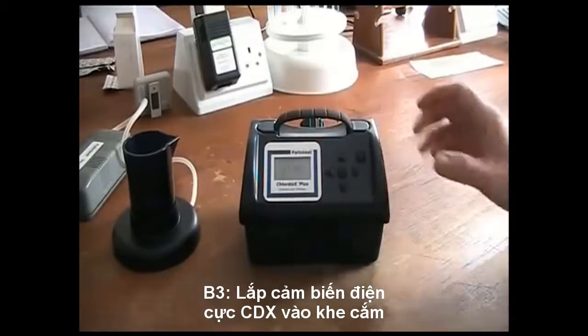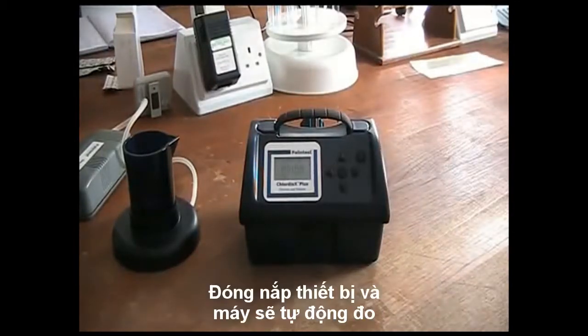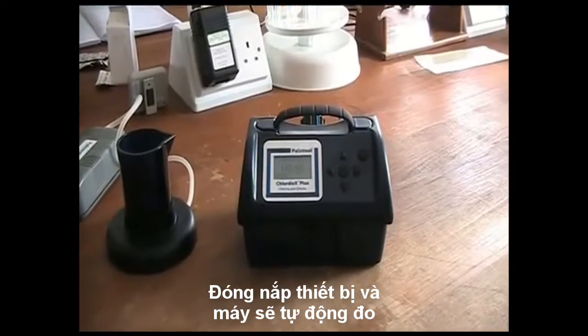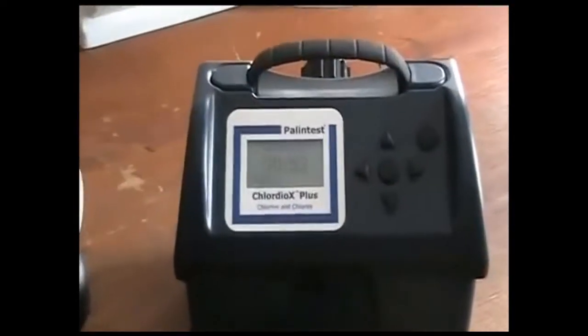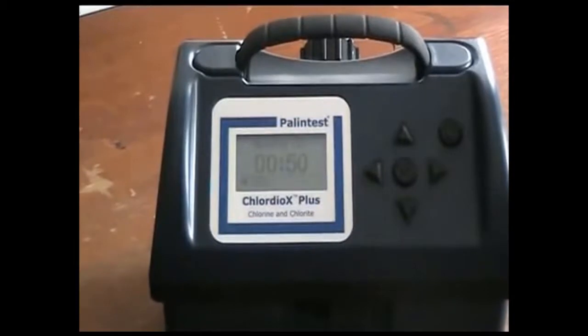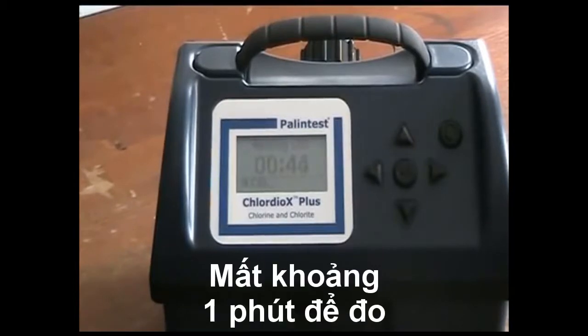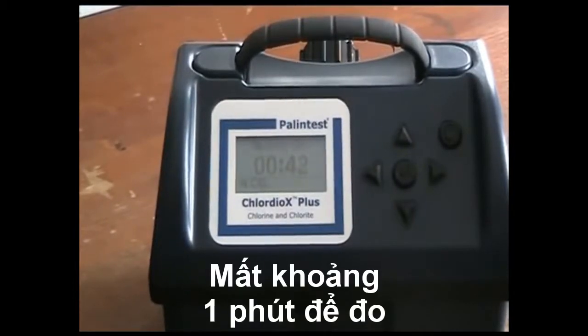Gently close the lid and the measurement will begin automatically. The measurement takes 1 minute. When the time has elapsed, the screen will change to show the result.